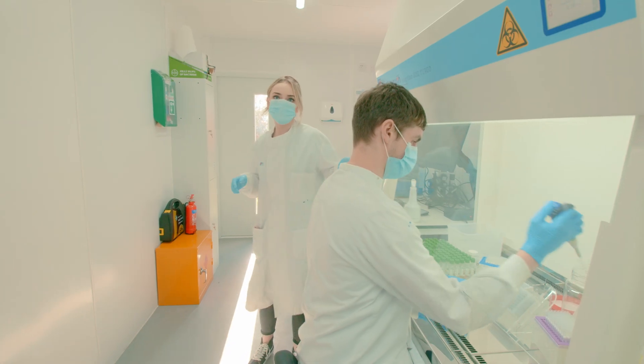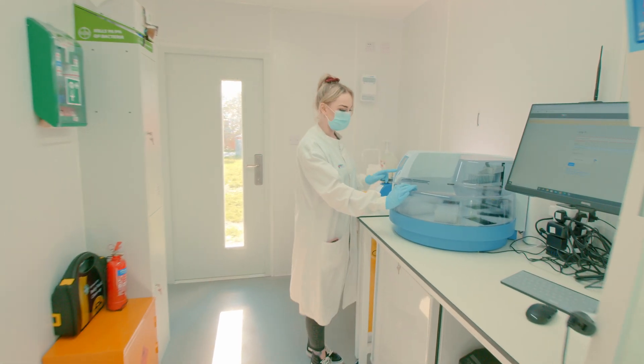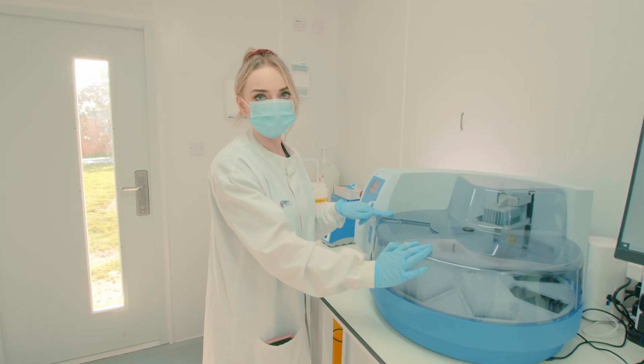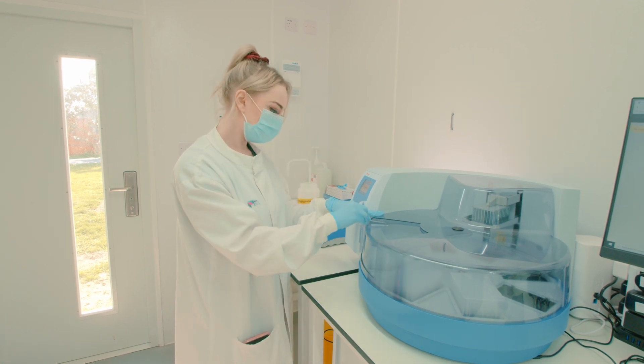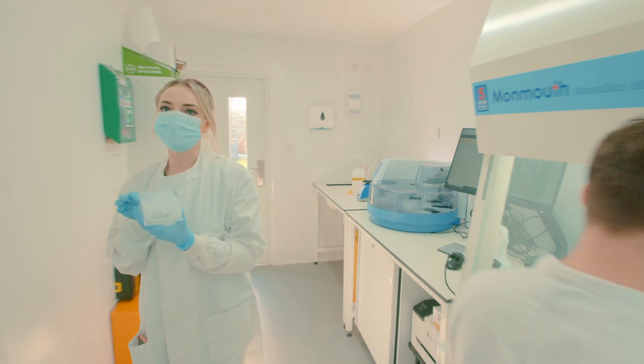Once we have a full plate of 88 samples, we load it onto our Kingfisher Flex along with some other reagents. This uses magnetic bead extraction to extract the viral RNA, and then we're left with an elution plate which we can then prepare for PCR.